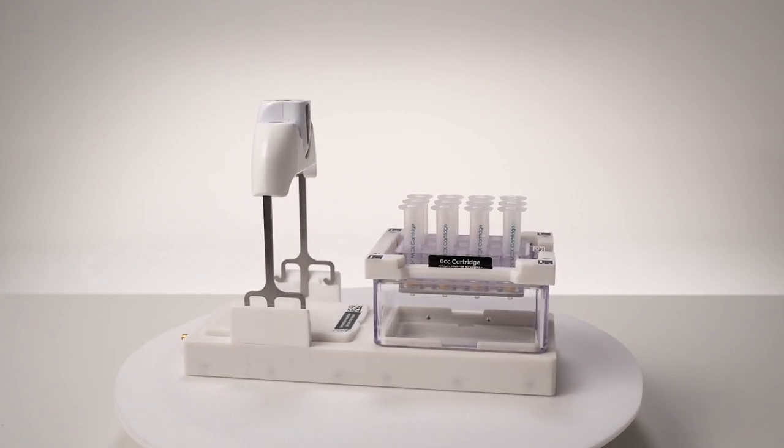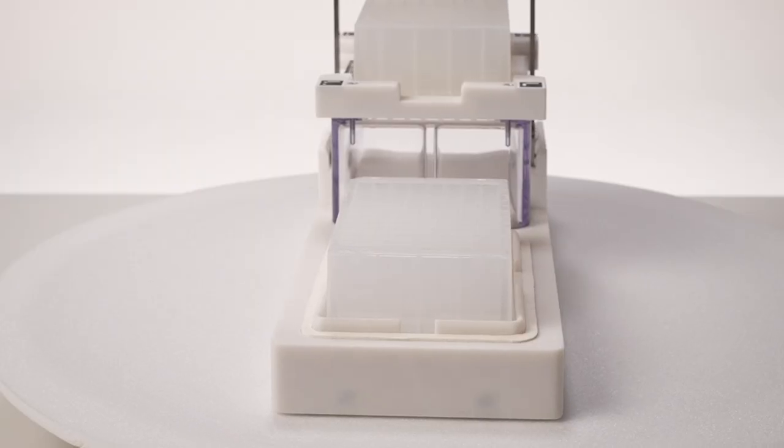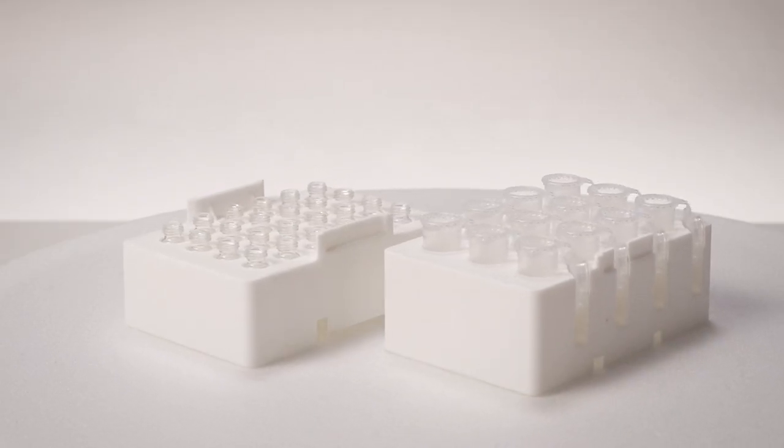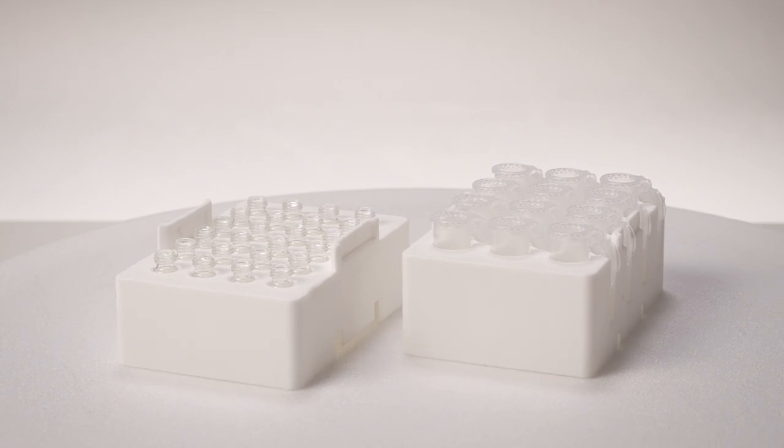The Extraction Plus device is also compatible with a wide range of collection labware, like deep well plates, HPLC vials, and large volume snap cap tubes, to best correspond to each extraction labware format and volumes.